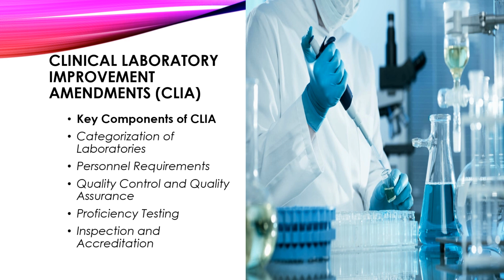Proficiency testing. Now, laboratories are required to participate in proficiency testing programs to assess the accuracy and reliability of their testing procedures. Proficiency testing involves the analysis of unknown samples provided by external proficiency testing providers to evaluate the laboratory's performance relative to established performance criteria.